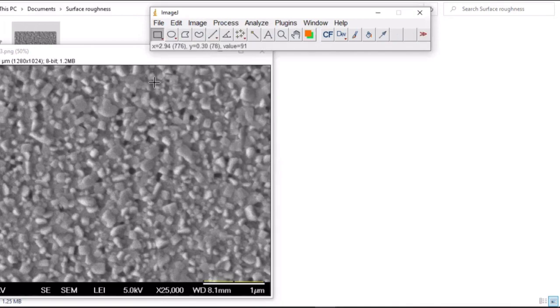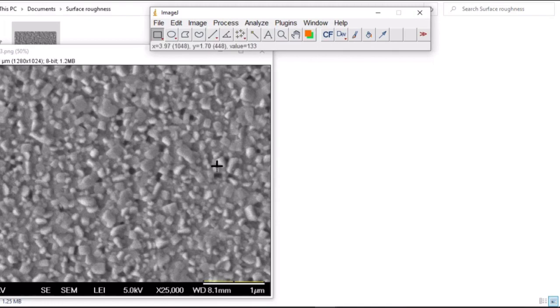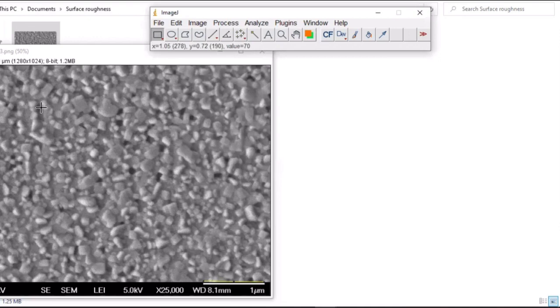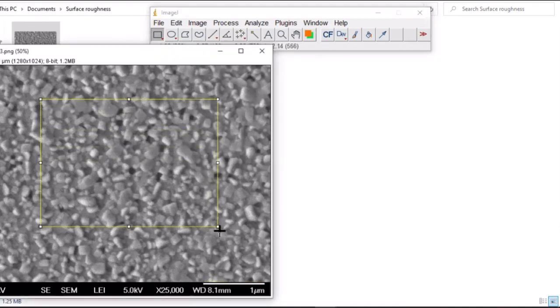Pick the rectangle. Here it is a polycrystalline thin film, so the grains have different orientations. We have large grains and small grains. You need to capture both the large grains and the small grains.